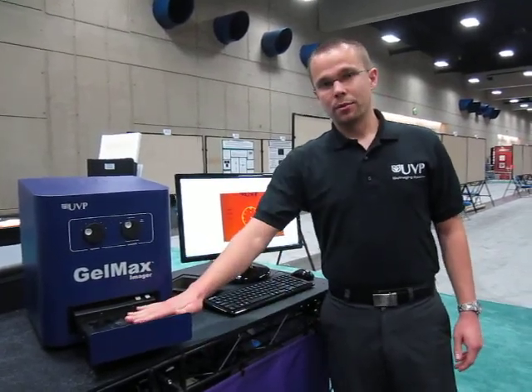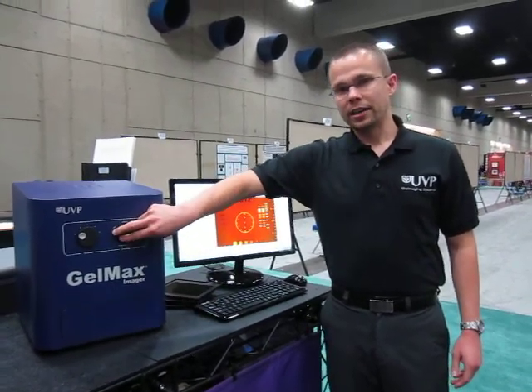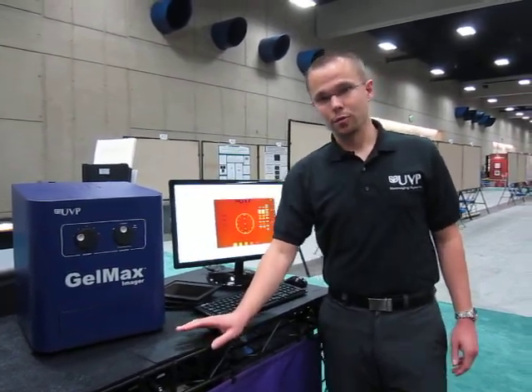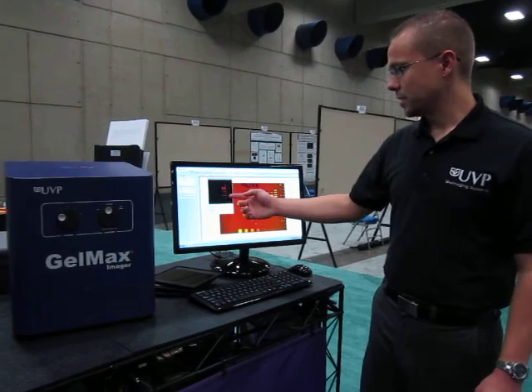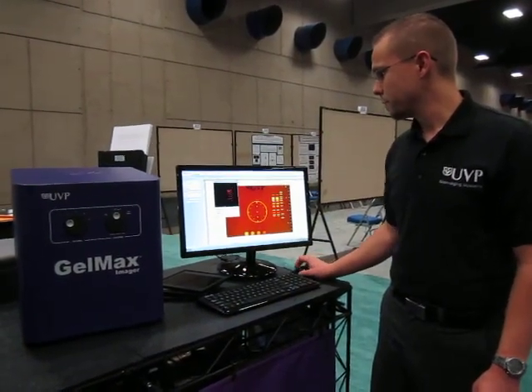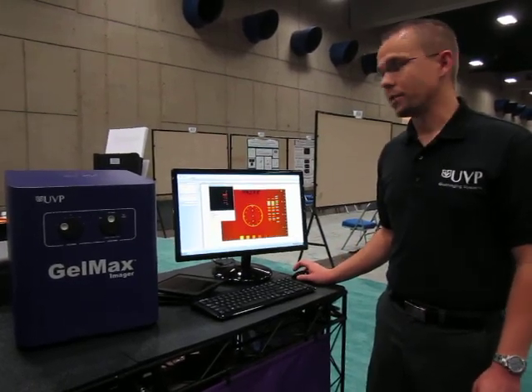The system is very simple to use. You place your sample on the transilluminator, slide it within the system, and select your lighting. Here we'll select UV transillumination. You'll select your emission filter — here we have it on position one for ethidium bromide. You go to the software and you can preview your image. We can see right here that the gel is lined up and perfectly aligned in the system. We'll select autofocus, and the system autofocuses to the sample within the system.